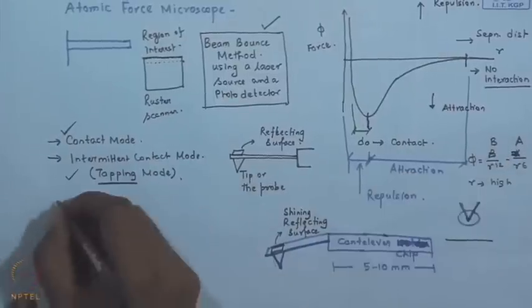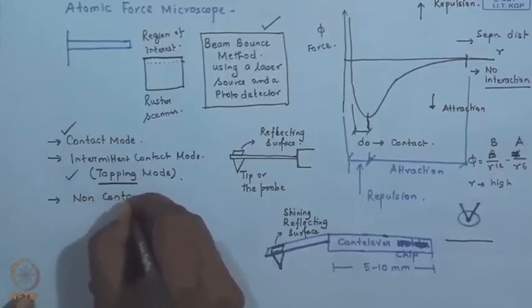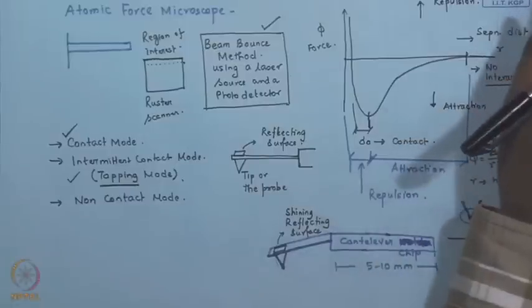Then you have additional modes also, the non-contact mode. We will discuss, and you will see that as a standalone mode, this is not really that exciting, because it offers poor resolution and the data quality is not very good. But based on non-contact mode and by some additional features, one can really generate a host of information.